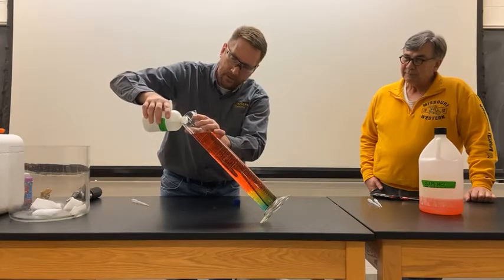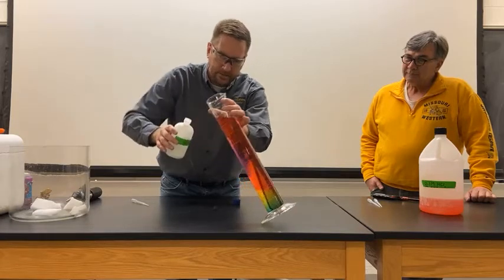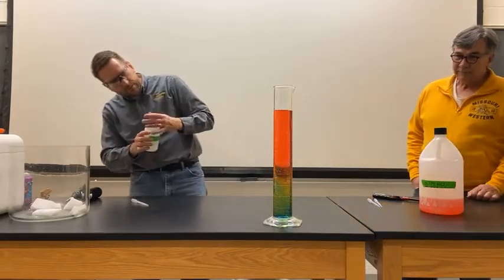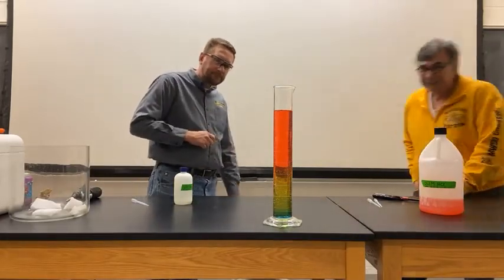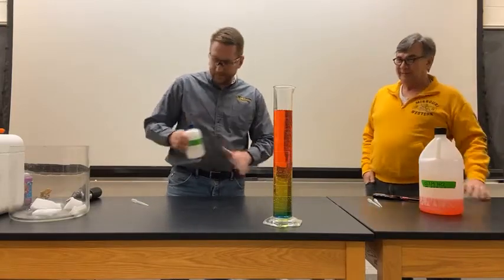Let's see if I can do it a little bit more. I'll put a little bit more in there so that we can see if we can get that to develop a little bit more. Oh, I think I mixed it a little bit. Oh, no, that's not too bad. Okay. You can see it go from blue to green to yellow to orange and then into the red.